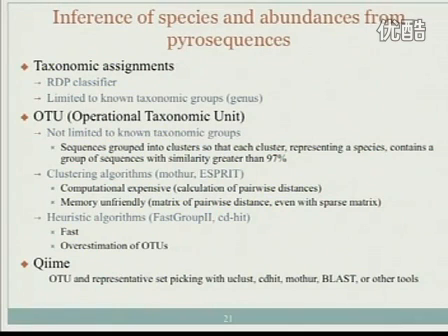And as I said, one of the goals is really to figure out the diversity of microbial communities in a sample. So you really want to go beyond those known species. That's the reason some people will try to cluster those 16S RNA genes. And from the clustering result, they try to figure out how many possible species there are in a sample.